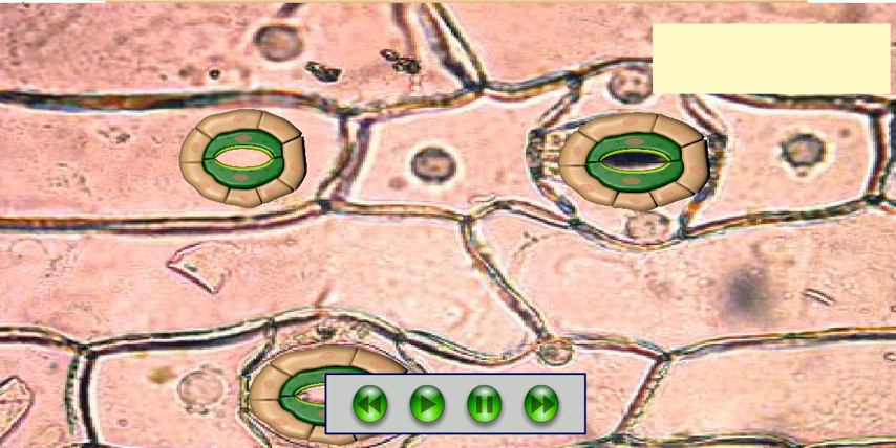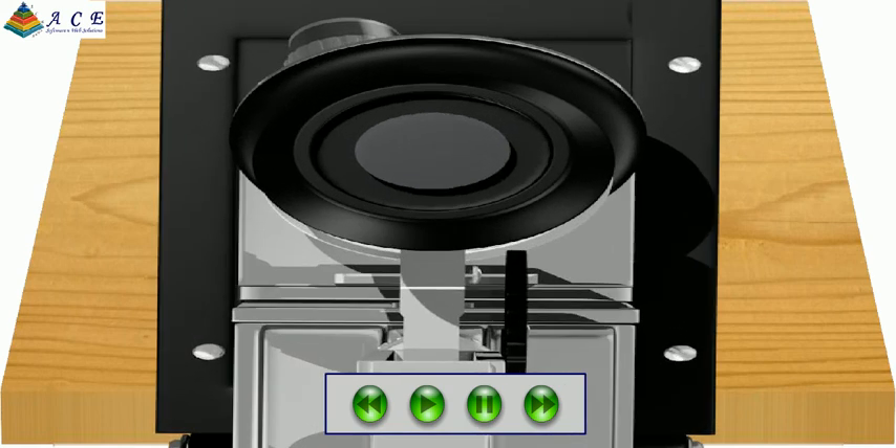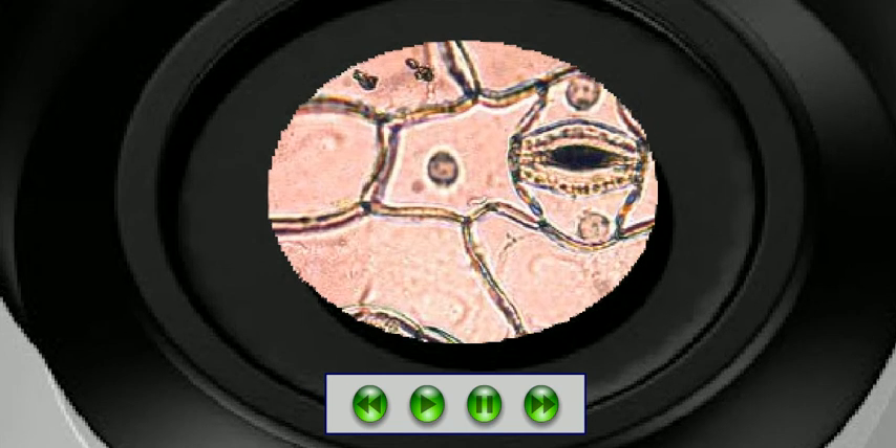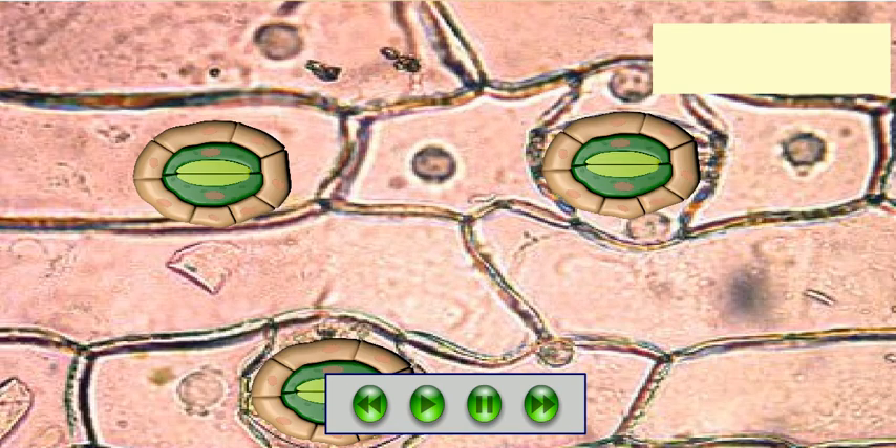Observe that stoma gets widely open after exposing to sunlight, and stoma is closed after keeping in darkness.